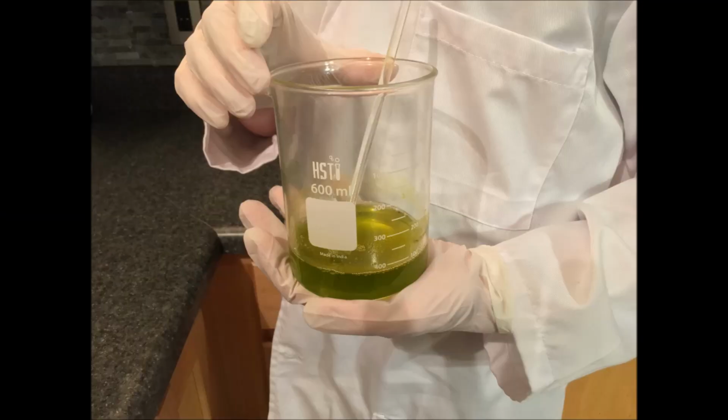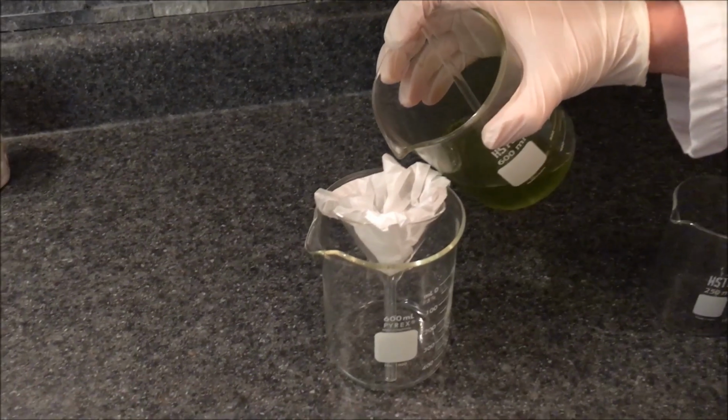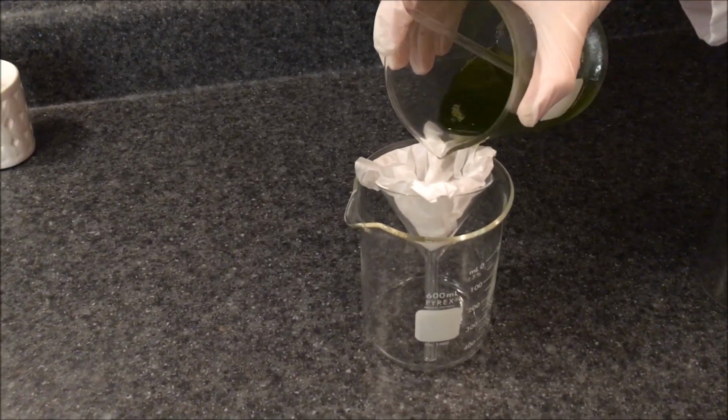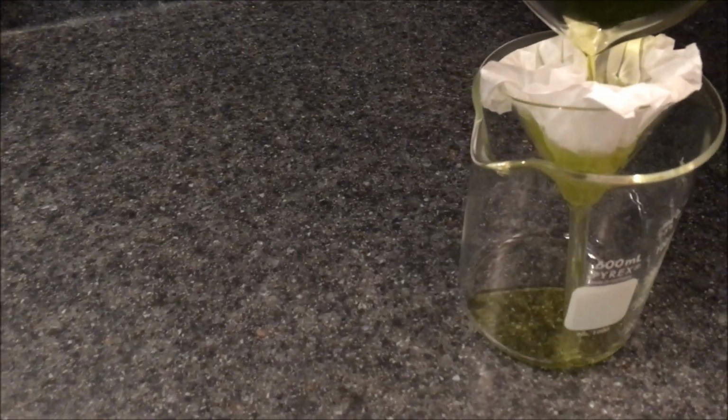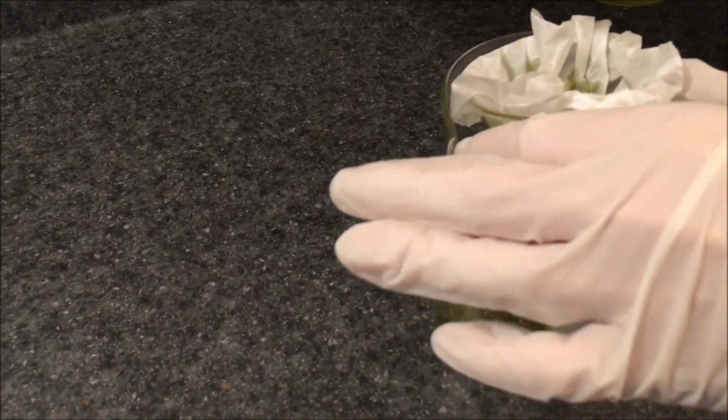I let the iron dissolve overnight and it took about 12 hours to dissolve. I then filtered the solution to get rid of any insolubles like carbon and other impurities in the steel wool.